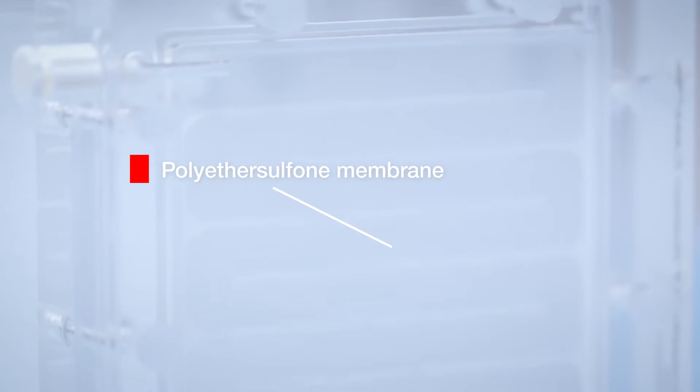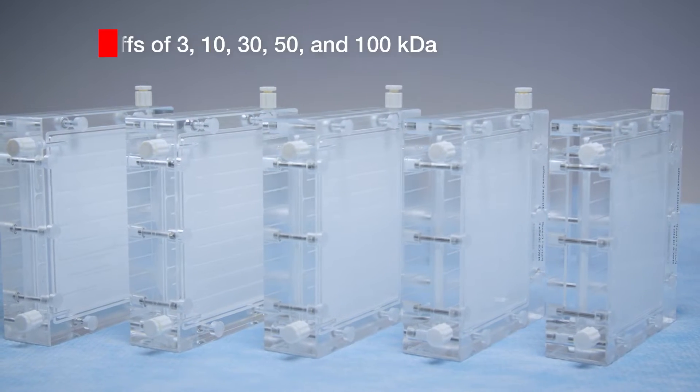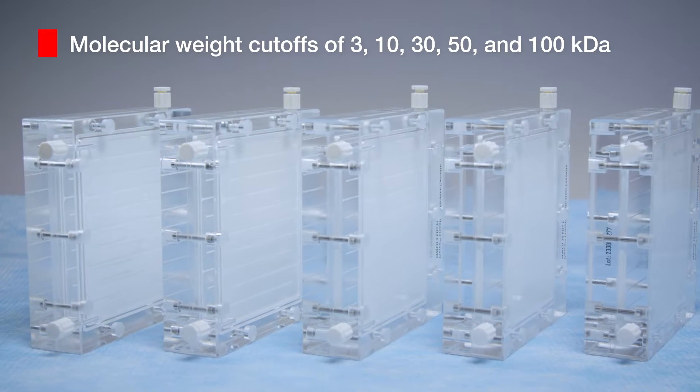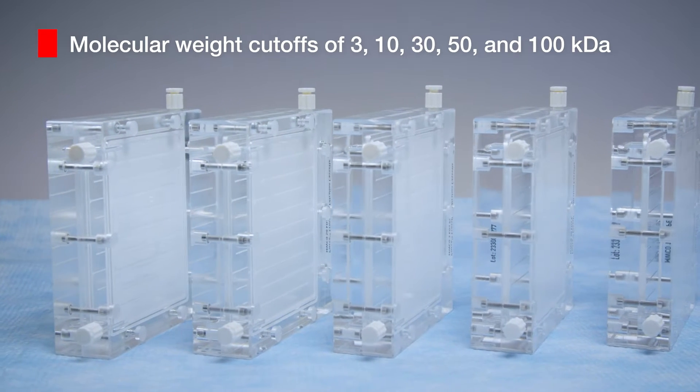The cassettes contain a polyethersulfone membrane and are available in five distinct molecular weight cutoffs of 3, 10, 30, 50, and 100 kilodaltons.